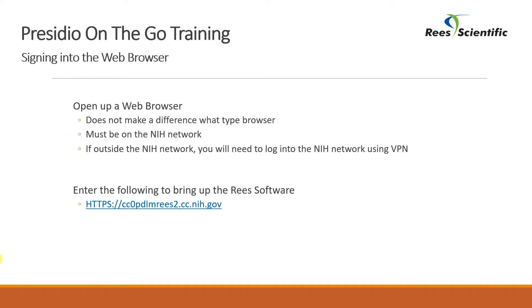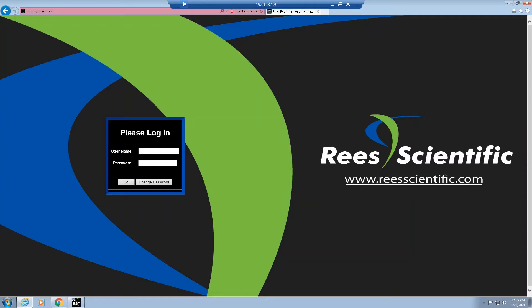Each customer site at the NIH will have their own individual web address to access the ReS system using Presidio on the Go. A sample address is on the screen, however you can contact your ReS administrator to get the web address for your node. After entering the web address the ReS Presidio on the Go logon will appear. You will need to enter your username and password to continue. If you do not have a username or password, or you've forgotten this information, you will need to contact your system administrator. Enter your username and password and hit go to log on to the system.